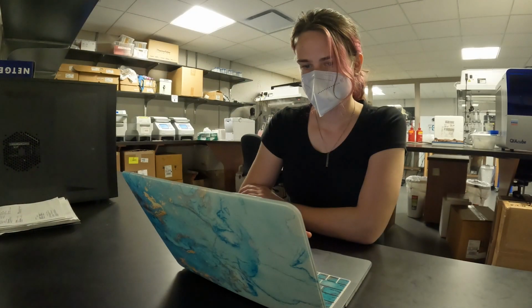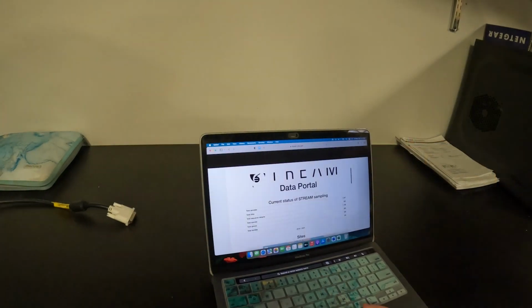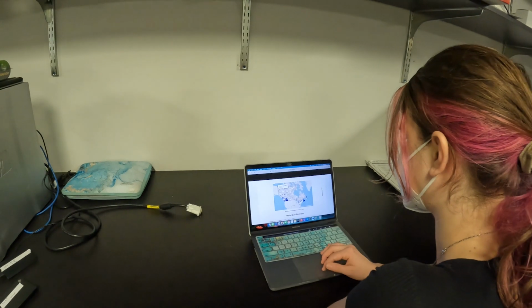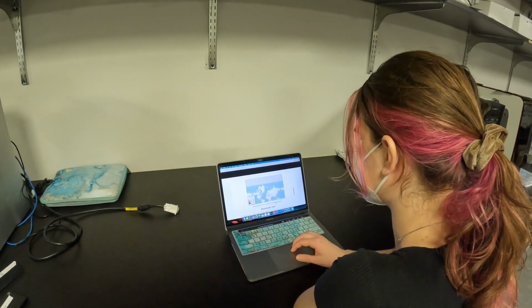Our lab team runs the sequence files through our analytical pipeline called MetaWorks before sharing preliminary data reports with participating community groups. All the data from those tiny benthic macroinvertebrates are then released onto STREAM's public data portal, where you can find over 1,000 biomonitoring sampling results from coast to coast.